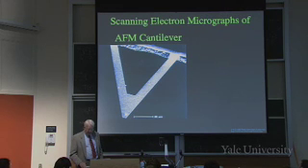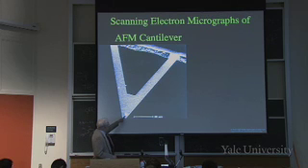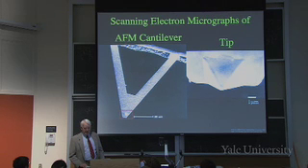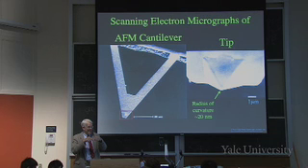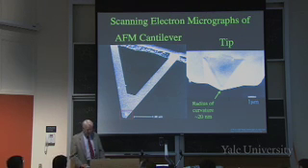Okay? Here's a higher resolution electron micrograph that shows the tip of one of these V's, and you see a little bulge here at the bottom. And if you zoom in on that, you see this. It's a little pyramid. And so at the bottom of that pyramid, the radius of curvature of this tip is only about 20 nanometers, so about the size of 20 molecules, right? It's round on the tip. It's not truly pointed to come to nothing, right? It's a little bit rounded. You can buy ones that are a third that size, their radius of curvature.